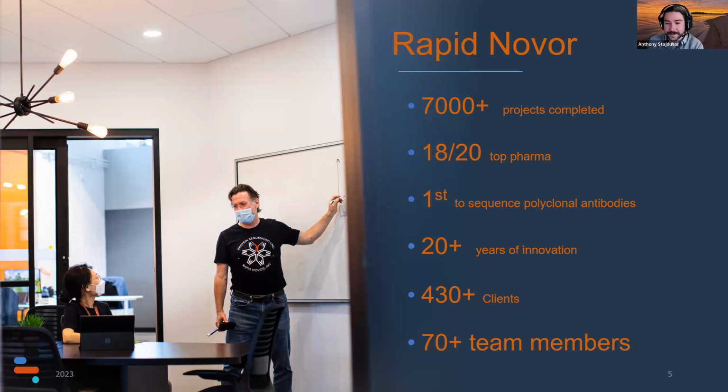We're quite excited to be able to work with these complex mixtures in pursuit of not only therapeutic antibodies, but also good reagents. Of course, some people just have good golden goats, golden rabbits, what have you. And we've been able to work with a lot of these types of polyclonal antibodies and derive the most abundant and usually the most functionally relevant monoclonal antibodies from those polyclonal mixtures.